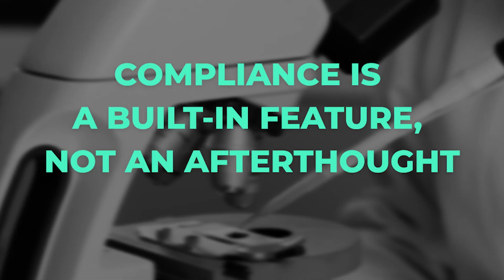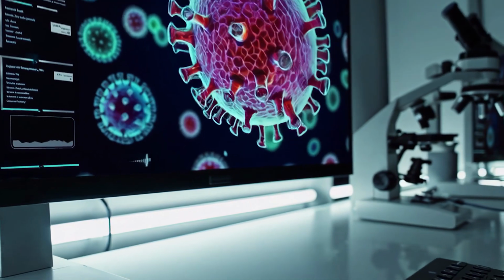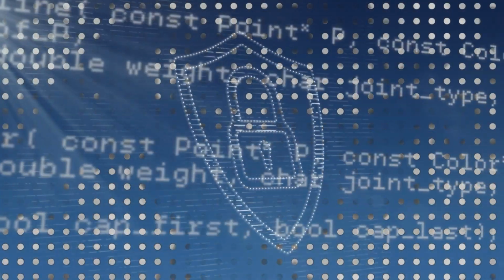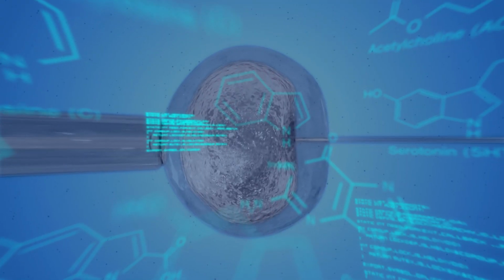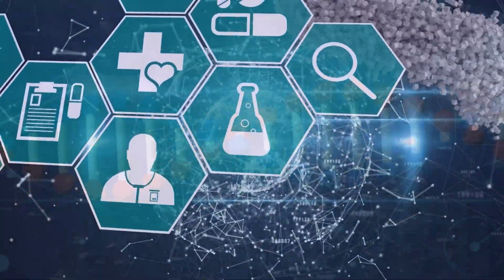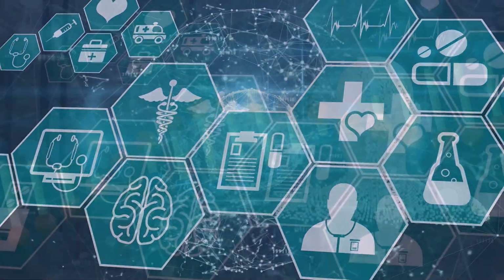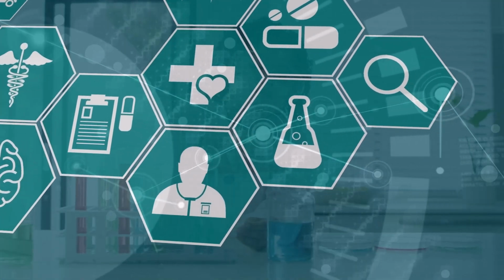4. Compliance is a built-in feature, not an afterthought. In a regulated field like pathology, compliance isn't optional. It's a requirement baked into every click. A well-integrated LIS should automatically track all user activity, log slide access, and store reports in a way that meets national regulations and local data privacy laws. Beyond that, it should support role-based access, encrypted communication, and lab accreditation requirements, so your lab stays ready for inspections and audits without scrambling at the last minute.